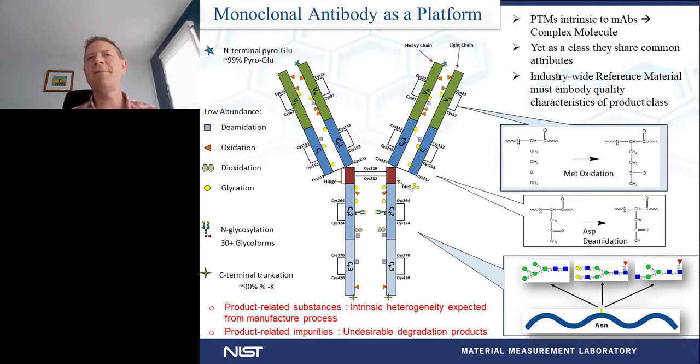We're going to use the same measurement techniques to look at these attributes, whether it be the primary sequence, post-translational modification, aggregation, size variance, etc. We're going to approach that measurement challenge in the same way. So when you start thinking about it in that direction, it really is possible to have a common material that can be utilized to do some harmonization throughout the industry.